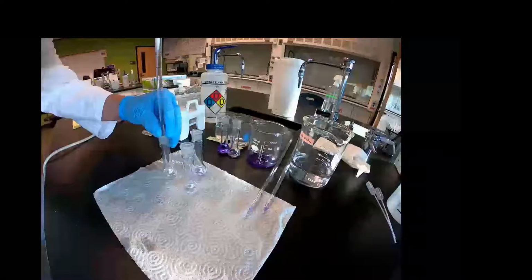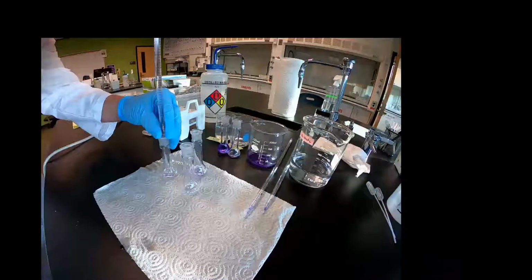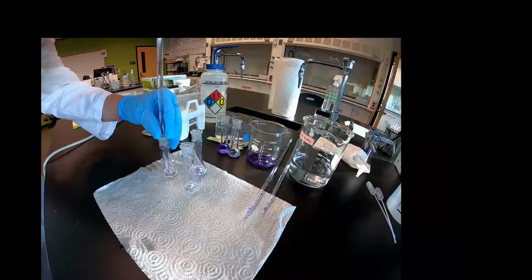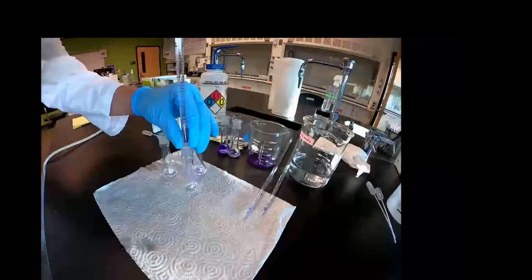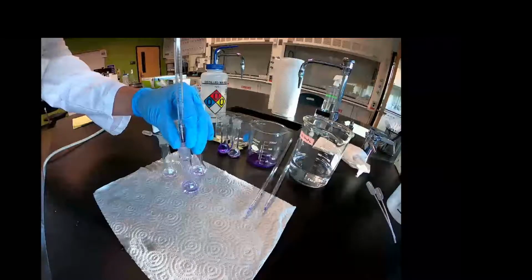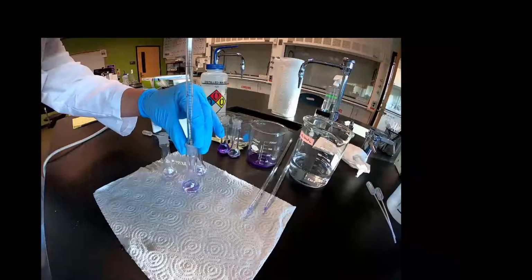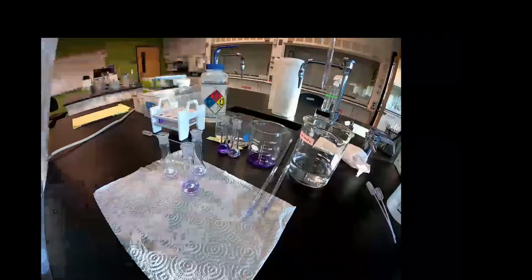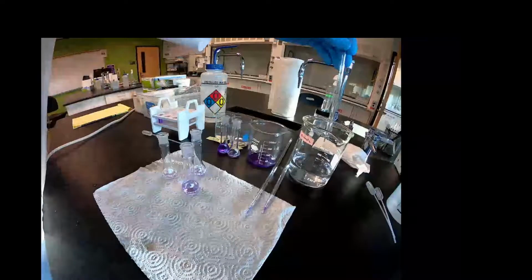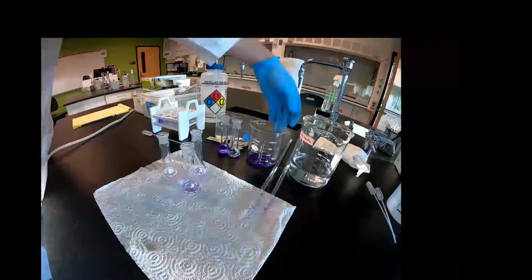Okay. Looks like he's putting maybe 5 in that one. Jump over here, and hopefully that'll be about 1, I'm guessing. It's hard to tell. Maybe that was 1 in the first one and 5 in the second one. All right, so now that should be enough of the number 3 solution in each.